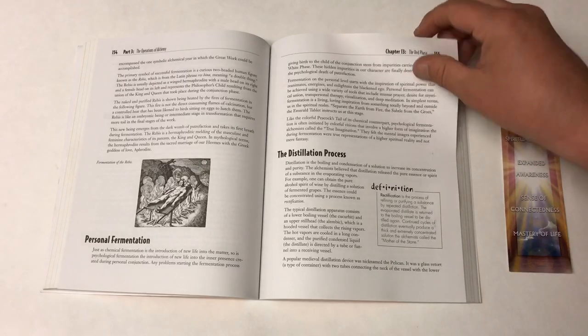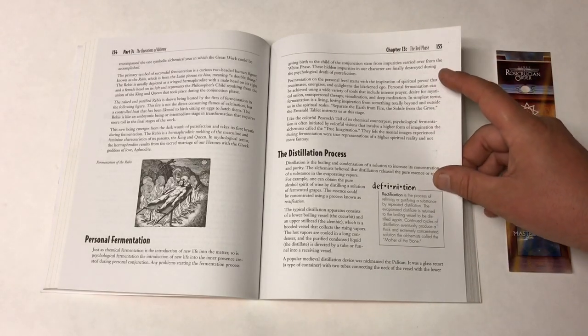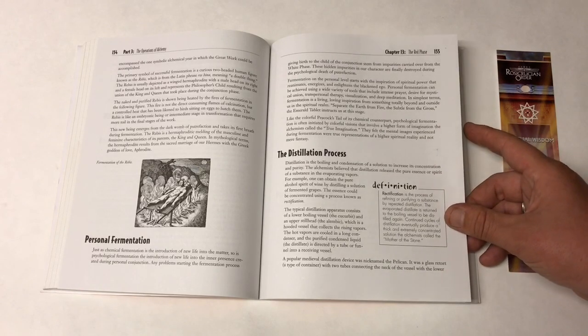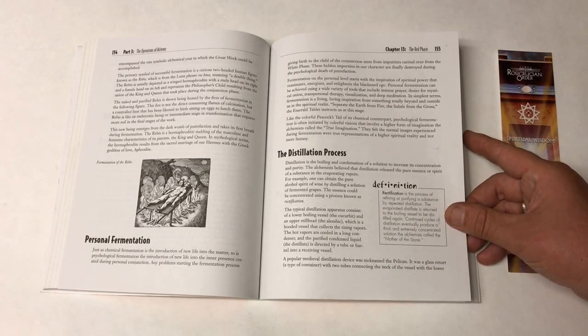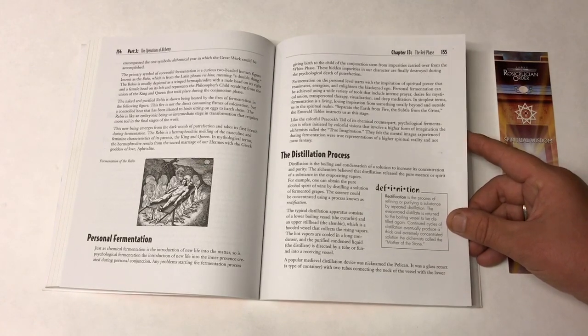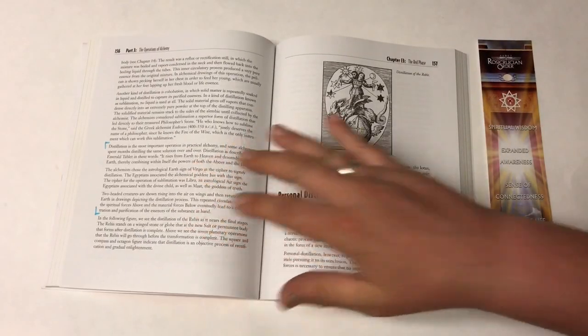A typical distillation apparatus consists of a lower boiling vessel, or the cucurbit, and an upper stillhead, or the alembic, which is a hooded vessel that collects the rising vapors. The hot vapors are cooled in a long condenser, and the purified condensed liquid, or the distillate, is directed by a tube or funnel into a receiving vessel. A popular medieval distillation device was nicknamed the pelican. It was a glass retort, a type of container with two tubes connecting the neck of the vessel with the lower body.